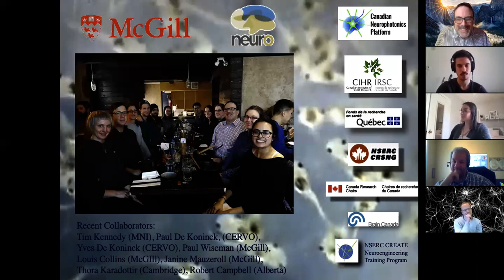But what were you thinking? Was there a brain area of particular interest? I don't know. I was just curious. One thing that one of my colleagues does that I think is really quite nice is the optic tectum. It's called optic tectum, but it's actually a multimodal structure. It's an integration center for tactile and auditory as well as visual inputs. So it's nice to be able to study that multimodal integration at the level of the tectum. And again, with calcium imaging, perhaps using some of Robert's different color reporters, it might be possible to look at different inputs and the activity there.